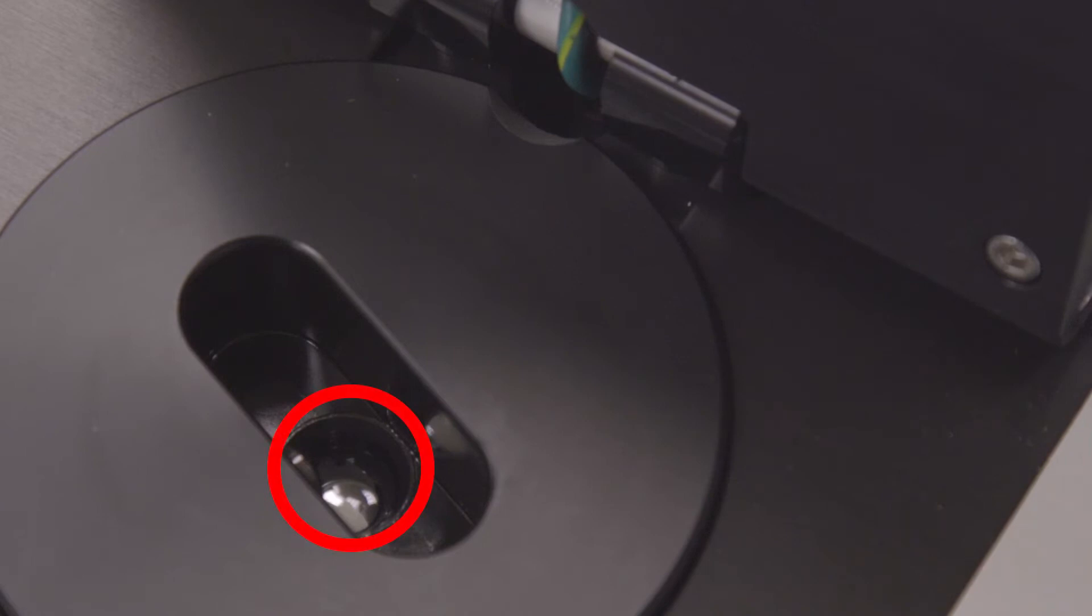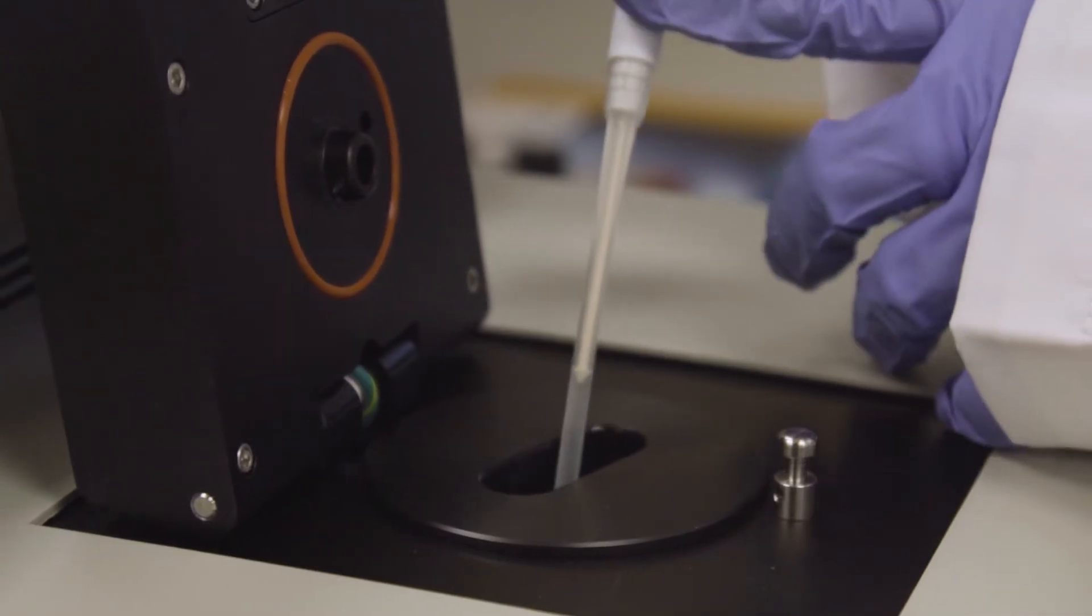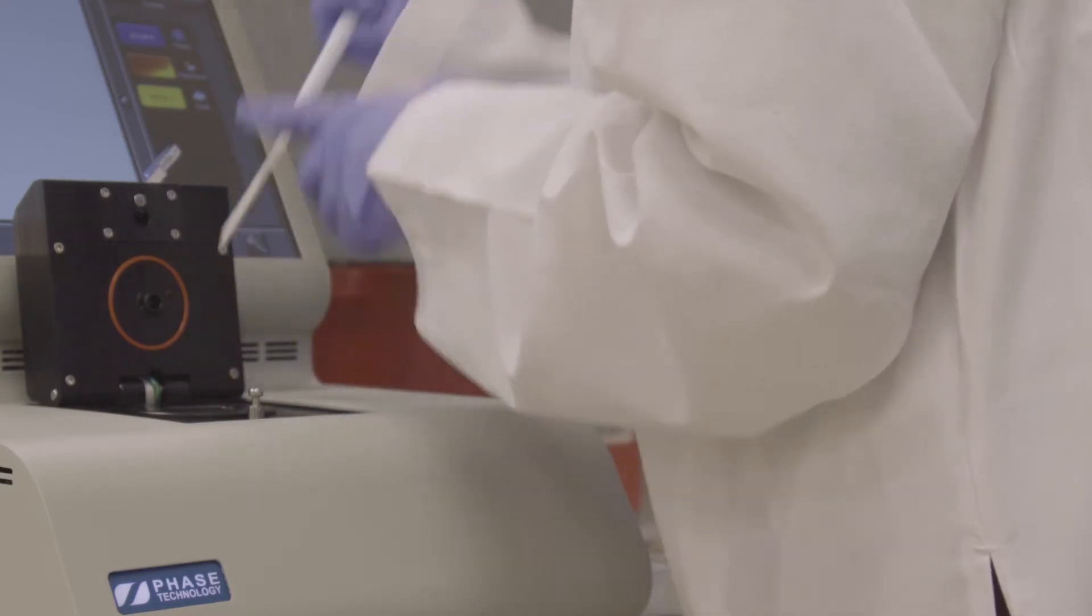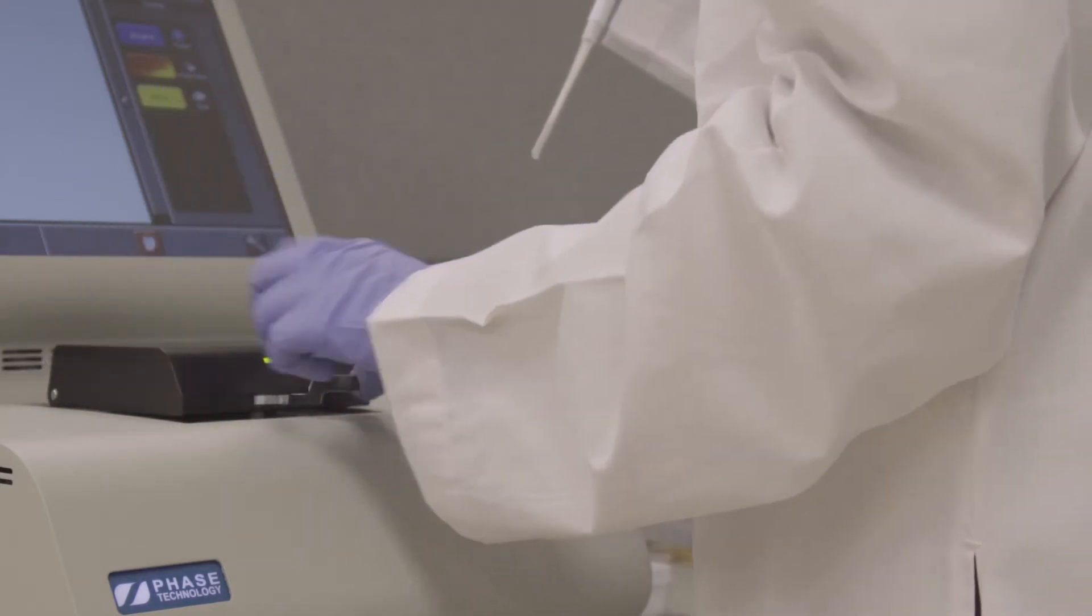Position the pipette tip above the sample cup inside the test chamber. Dispense the sample by pressing the plunger down to the first stop. To remove the pipette tip, press the plunger to the second stop.